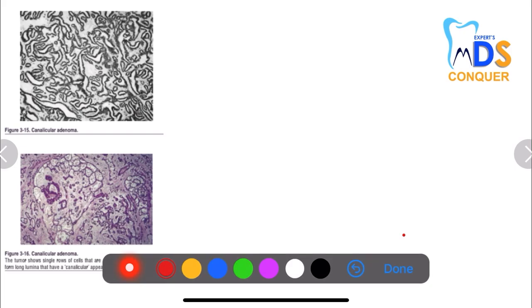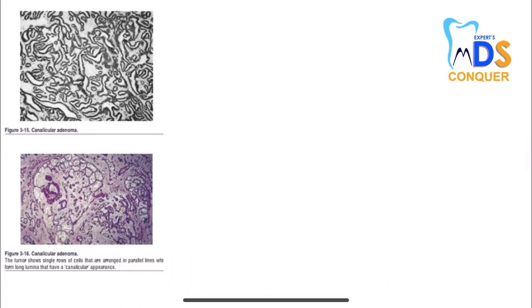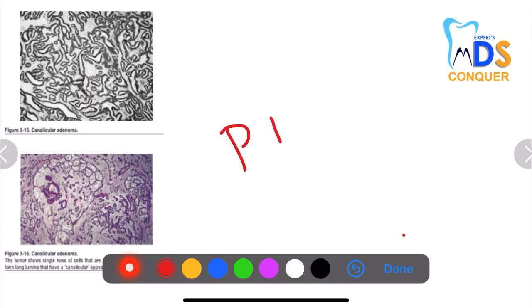Next, the party wall appearance is seen with canalicular adenoma, where the tumor shows rows of cells arranged parallelly, forming long lumina with a canalicular appearance. This is the party wall appearance related to canalicular adenoma.